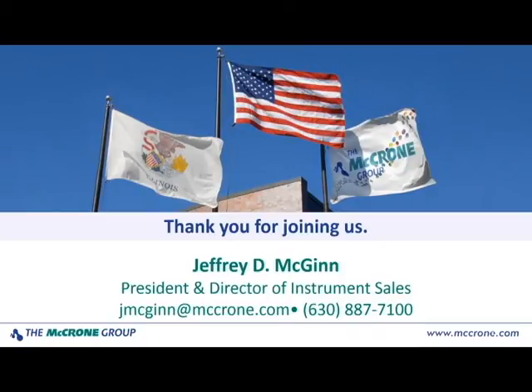From Stefan here, were the business card images coated, or were they taken using a variable pressure SEM? They were coated with a fine layer of gold, actually.